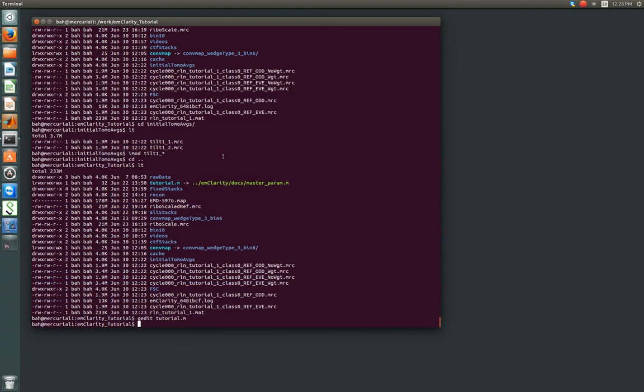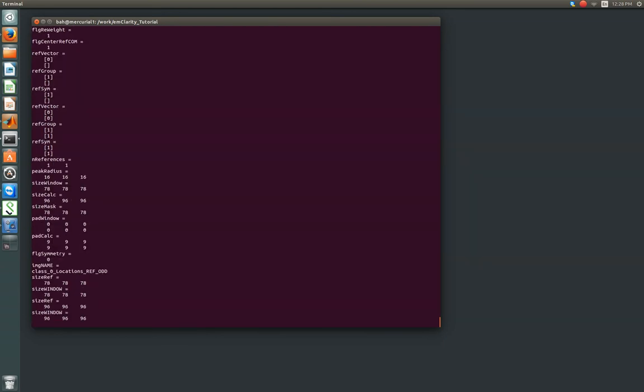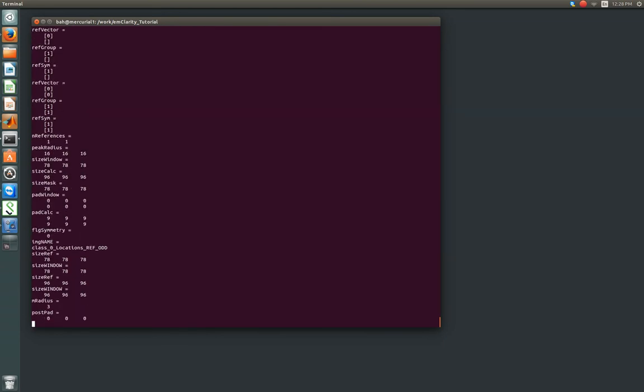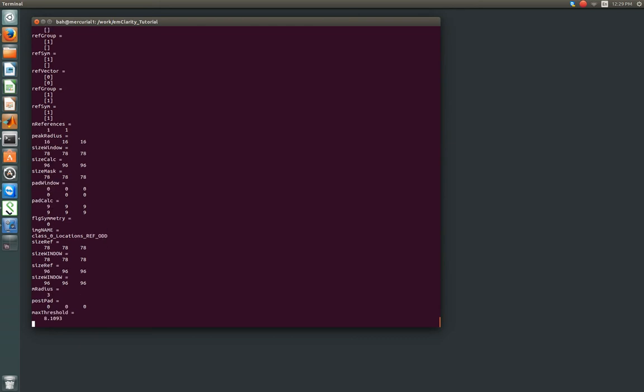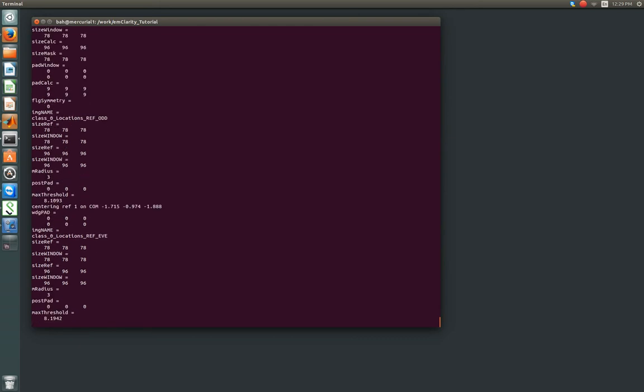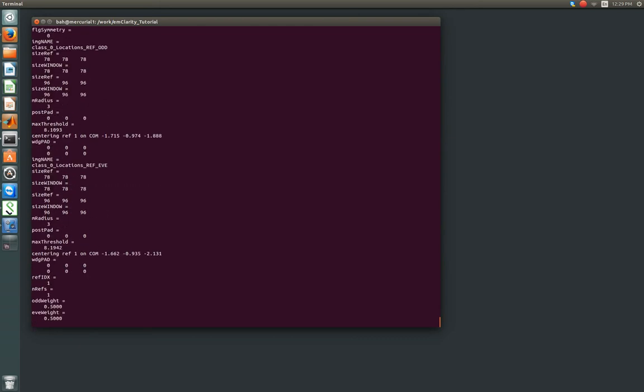We're going to call emClarity, alignraw, give it the parameter file, and there's cycle which is 0. And we'll set that off. And it will run, and it'll be good. After this finishes running, you'll then create a new average. This time running emClarity average parameter file, and now you're giving it cycle 1. And instead of no alignment, for all subsequent iterations, you're going to type raw alignment, capital R-A-W, and then alignment. And it'll, again, give you the same things. An FSC, a raw volume, the cumulative CTF, and then the re-weighted volume based on the adapted single particle wiener filter.